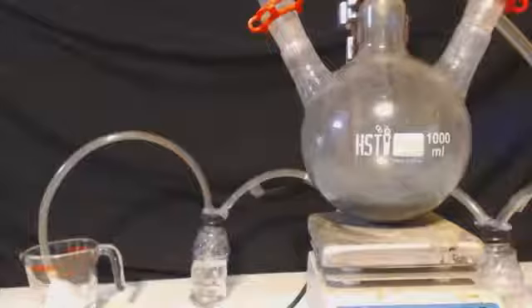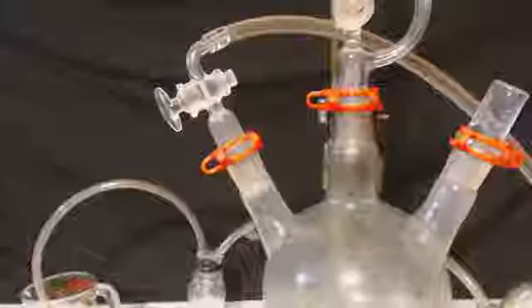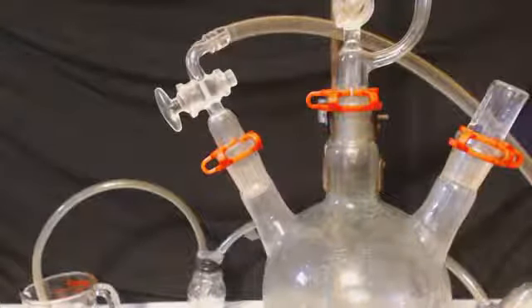Yeah, that's actually too much bubbling. I'm just turning it up so you can see what it's like. So I'm back to it. I'm trying to get the drip rate slow. I don't want to go too fast. That's basically all I'm doing here, just dripping it in there, letting it spin and react.